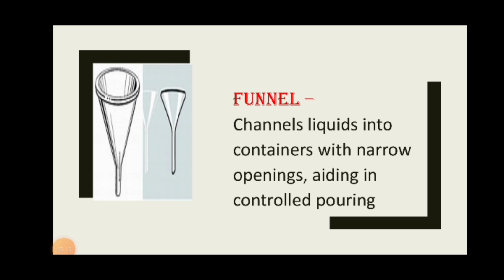So, halimbawa, meron kang i-transfer na amount of substance or reagents to another container, and it just so happens that your container has a very narrow neck. At yes, to avoid spillage or any accident, of course, you use funnel, no? So you can transfer it completely.